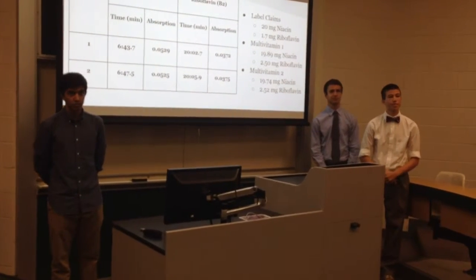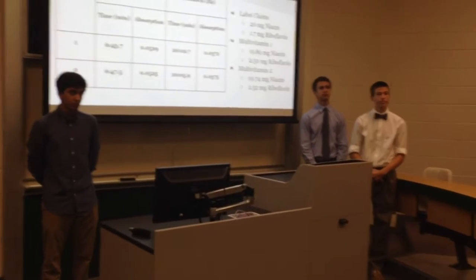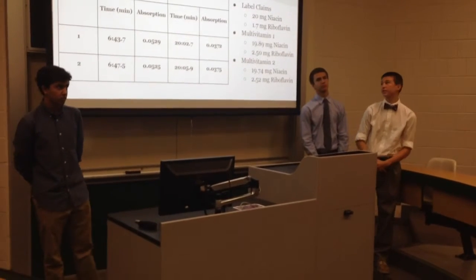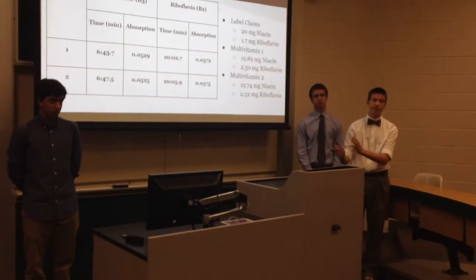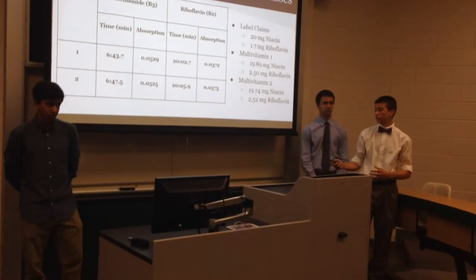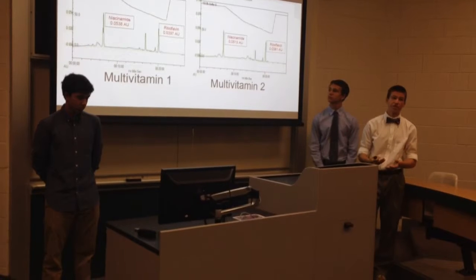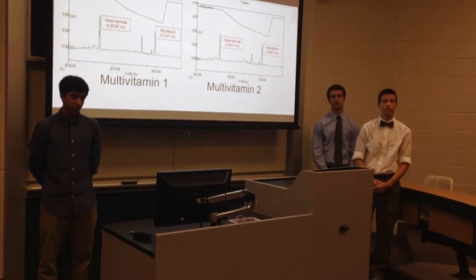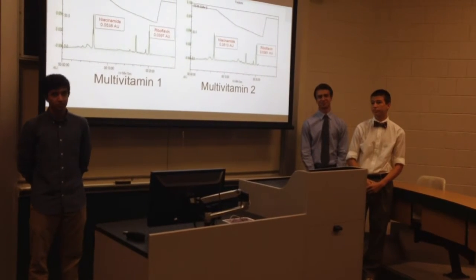Yes, Elizabeth. Did y'all look into the possibility that another vitamin could have been colluding with the riboflavin and giving you exaggerated results? Yeah, it could have been. We tried to run through the HPLC to get the individual peaks, but because riboflavin has a poor solubility, it was actually really good that it had such a good absorption rate. So there could have been another peak under that came out at the exact same time that could have caused higher riboflavin amounts than expected. Future testing will be able to figure it out.